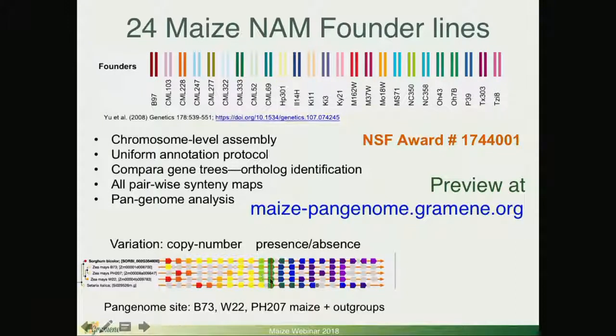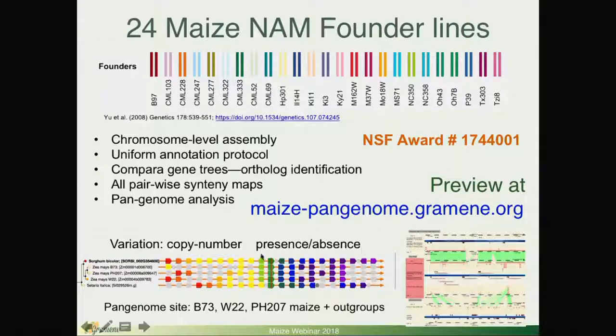our tools will allow us to answer questions as simple as copy number variation, presence, absence. Remember this gene neighbor view? You can see whether, compared to sorghum or the reference maize, a number of genes surrounding your gene of interest are conserved or not. That would be at the protein level, but you can also see at the DNA level whether the actual sequence is conserved or not.